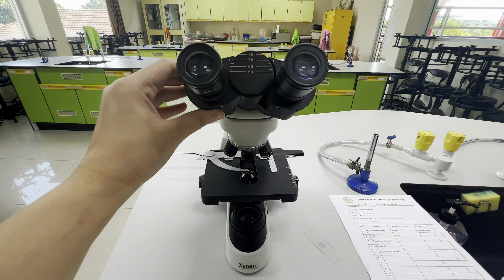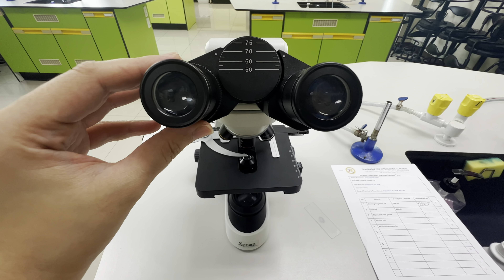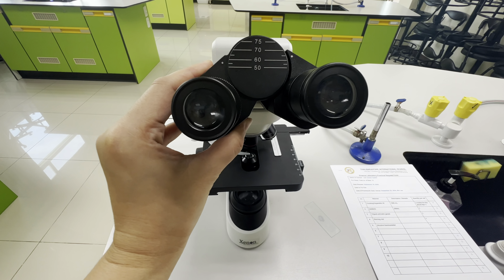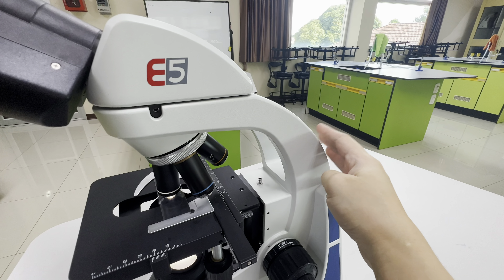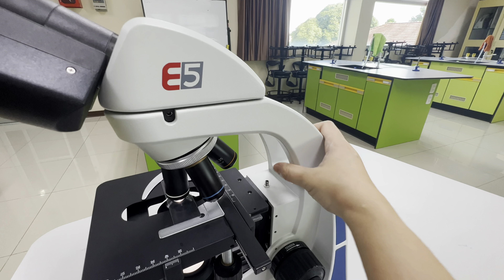This is a binocular compound microscope. It has two ocular lenses, one for each eye, that makes viewing easier. The ocular lenses magnify the image of the specimen. They are usually 10 times or 15 times power magnification.